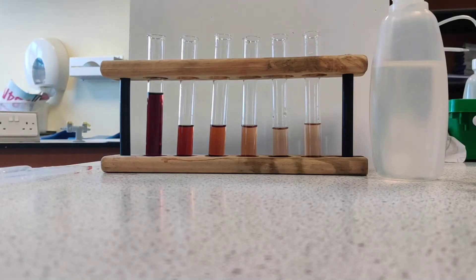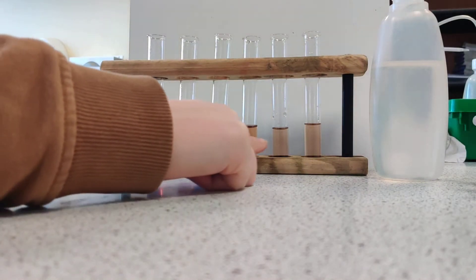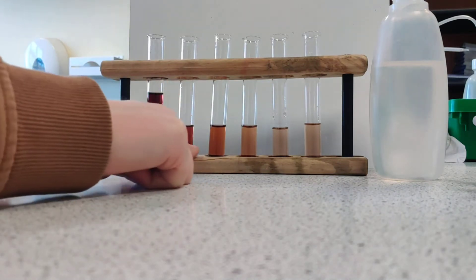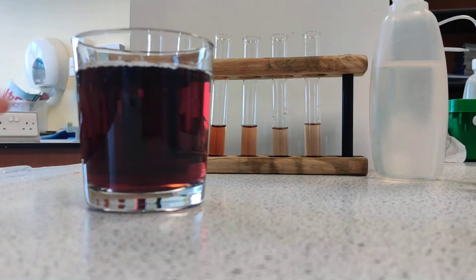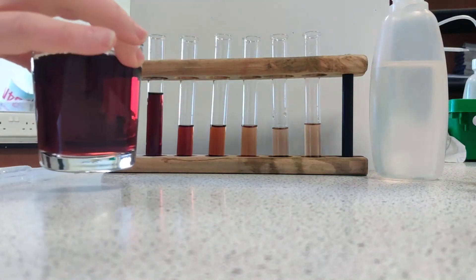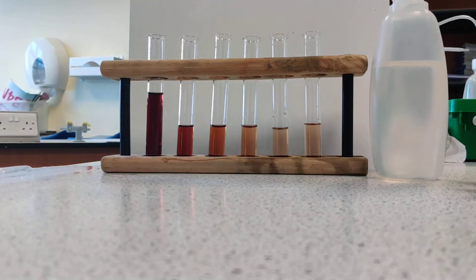There you can see the serial dilution. As we go from left to right the concentration is getting more and more diluted, and the colour is getting lighter and lighter. If we compare that to the original glass of juice, we can see that it's going to fit somewhere within that range. We could be vague about where it is, or we can use colourimetry to help us be absolutely exact.